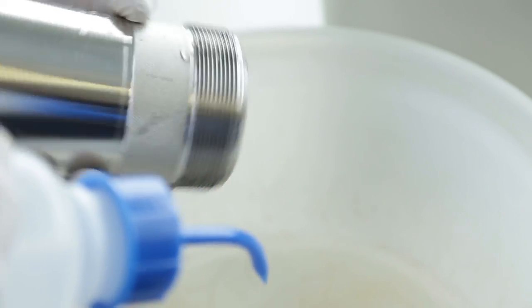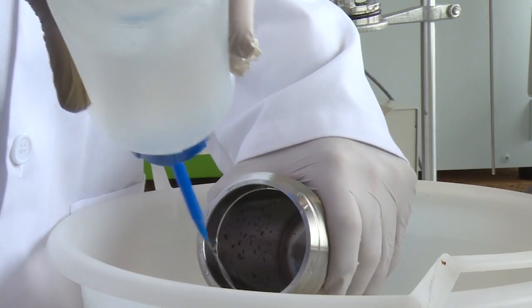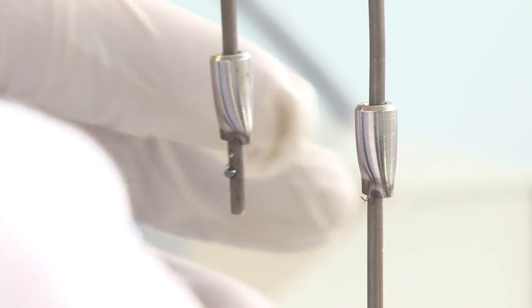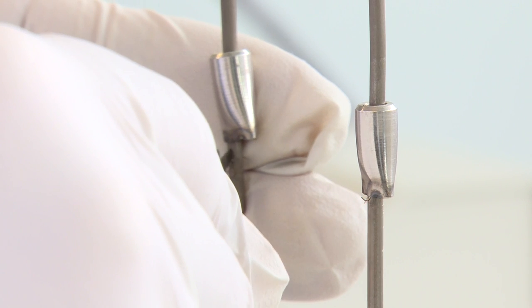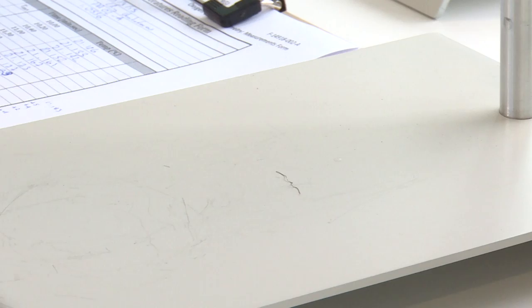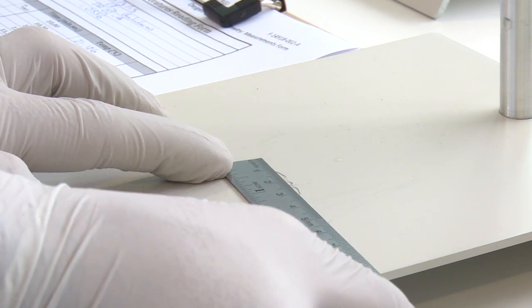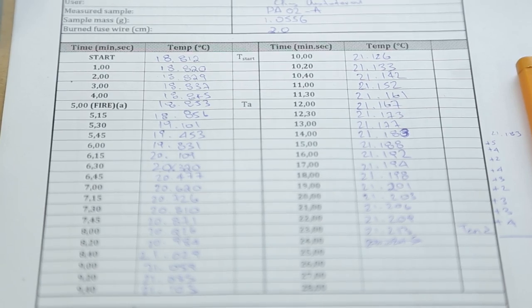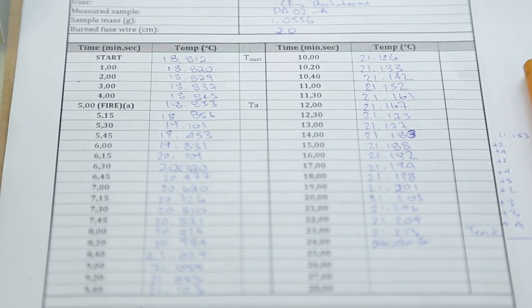Wash all interior surfaces of the bomb with a jet of distilled water and collect the washings in a beaker. Remove all unburned pieces of fuse wire from the bomb electrodes. Straighten them and measure their combined length in centimeters. Subtract this length from the initial length of 10 centimeters and enter this quantity on the data sheet as the net amount of wire burned.